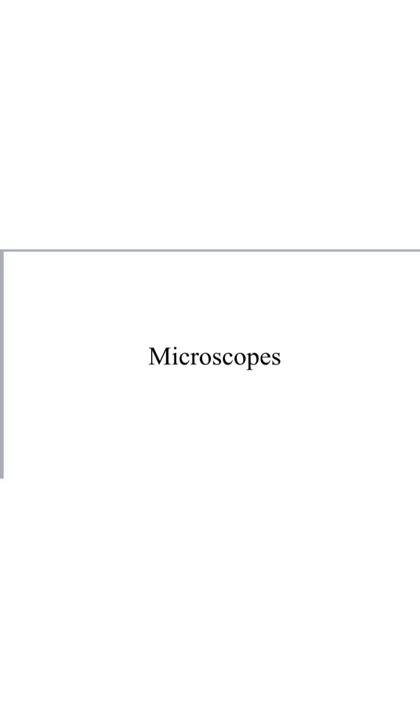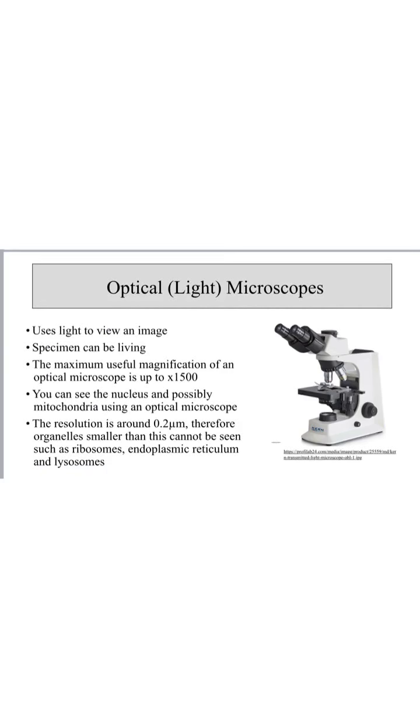Today I'm going to talk to you about the different types of microscopes and compare them to one another. First, I want to talk about the optical or the light microscope, which will be the type of microscope that you'll be most used to and you'll have used in class before.